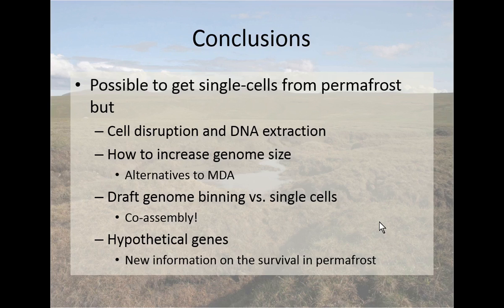And then, how to increase the genome size, so there could be use of alternatives to MDA, just to get bigger genomes and more amplified. What I'm doing at the moment is some co-assemblies of the draft genomes and the single cells, or the metagenomes and the single cells, to see if I would get nicer genomes that way, but then I could also create some chimeric genomes.